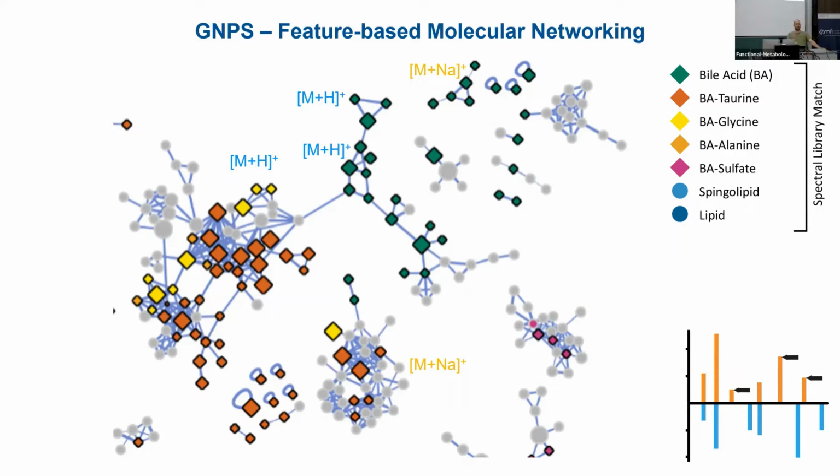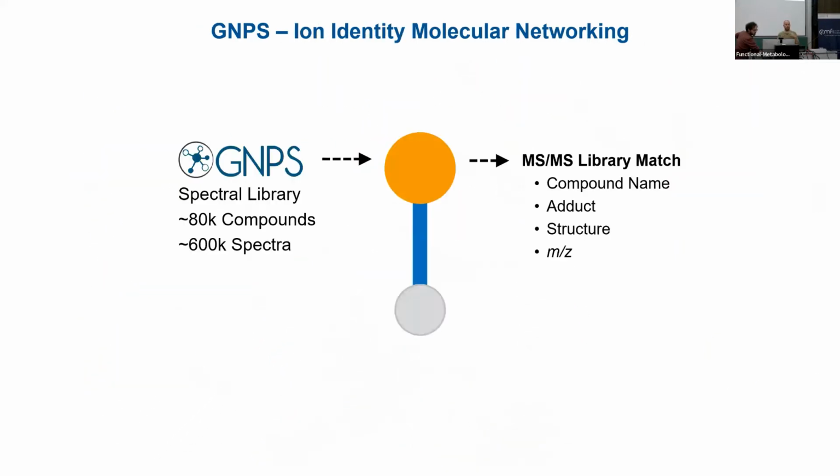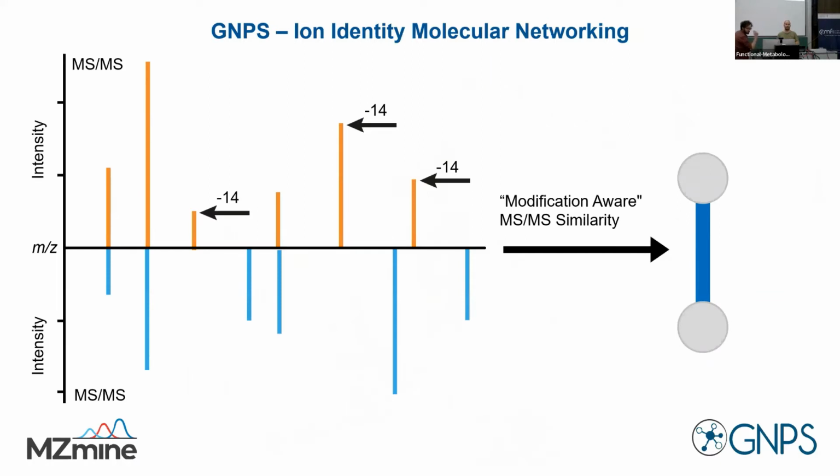It's important to not mix up MS1 and MS2 there, right? In MS2, we isolate only one ion at a time and then fragment it. So if there is already a pattern that would be natural from your metabolome, then that would be all individual peaks. Obviously, those should have similar fragmentation patterns. So we would hope that biotransformation products will be connected in the network. And I think that's exactly one of the strengths, right? That we pull related metabolites together and cluster them in molecular families.